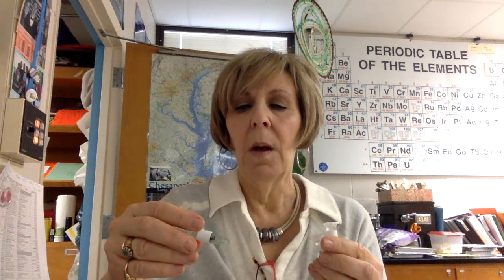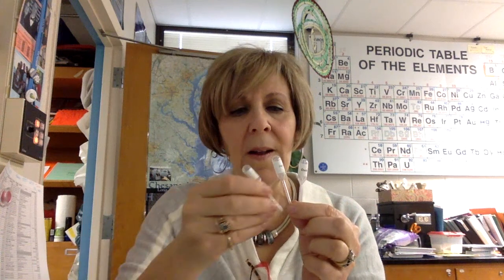And so in another little container, you will find a sample of the drinking water in their house, the dust in their house, the pottery in their house, their plates that they eat off of, and also the soil around their house. And there is a corresponding labeled little pipette that goes with those 4 samples. Okay, so these little push caps have a sample in them. And so obviously you know about contamination, right? So you're going to take a specific one of these that matches.